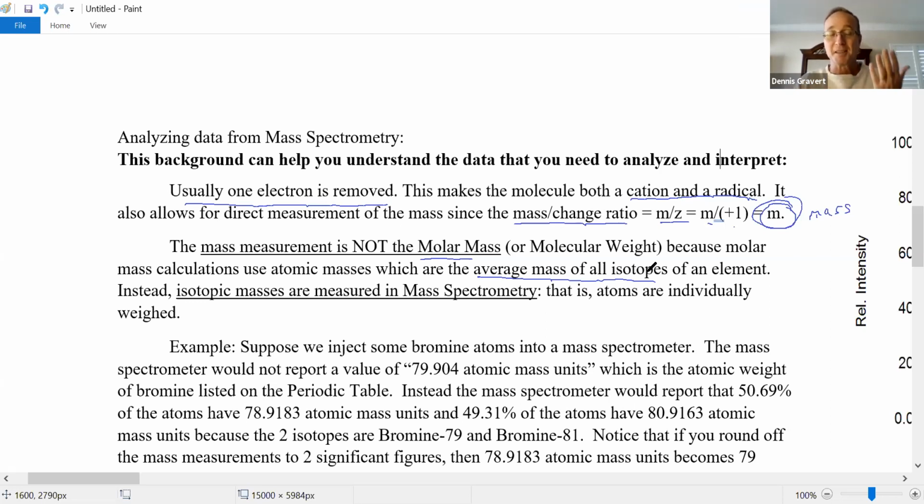So carbon, the most common isotope of carbon is carbon-12, but there's also carbon-13. And you know about radioactive carbon-14, carbon dating, like looking at fossils and seeing how old they are. Carbon-14, yeah, that's carbon that has 2 more neutrons than most of the carbon on planet Earth. Carbon-12, the most common form, and 2 more neutrons makes it carbon-14 and radioactive. So in a mass spectrometer, you can actually see individual carbon atoms, measure them, and decide if they're carbon-12 or carbon-13 or the rare form carbon-14.